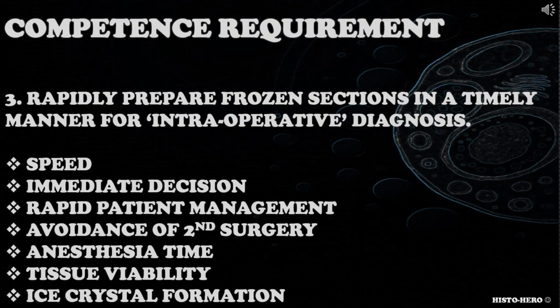The third competence requirement is rapidly prepare frozen sections in a timely manner for intraoperative diagnosis. Candidate should be able to rapidly prepare frozen section. Can the candidate prepare frozen section rapidly? Do they know the importance of preparing frozen section for intraoperative diagnosis rapidly?